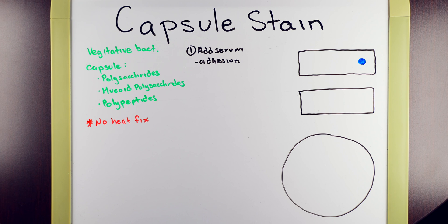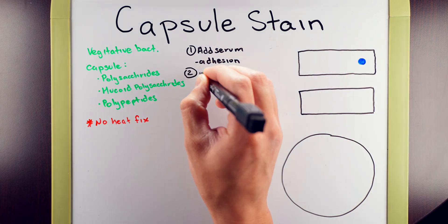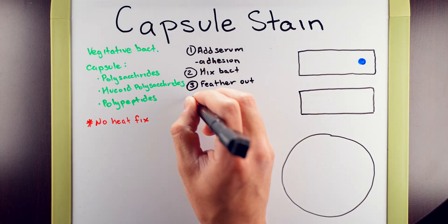If you need a refresher on the feathering out technique, I'm going to leave the video link for you guys right over here. As soon as you feathered out the slide, allow some time to pass for it to air dry.